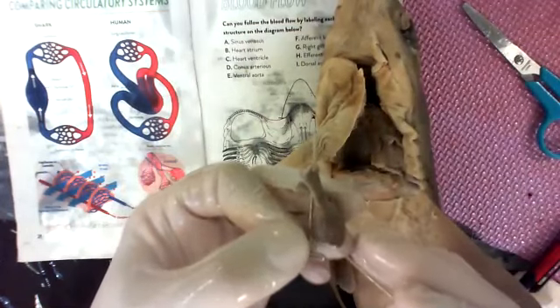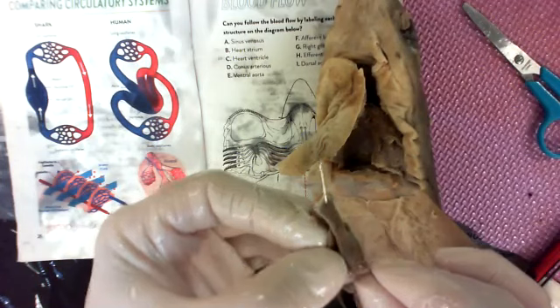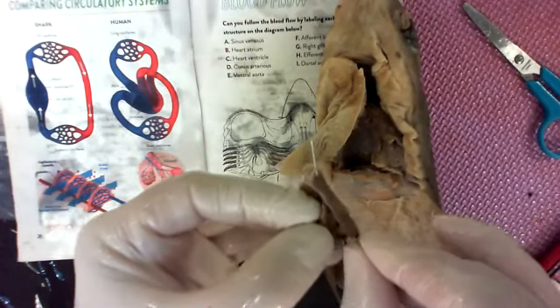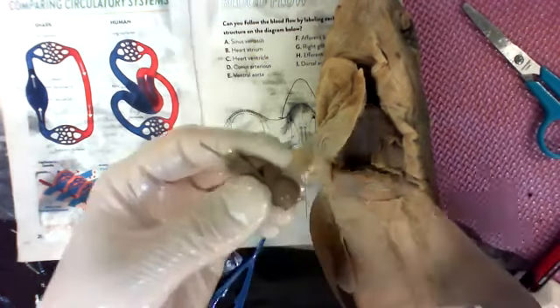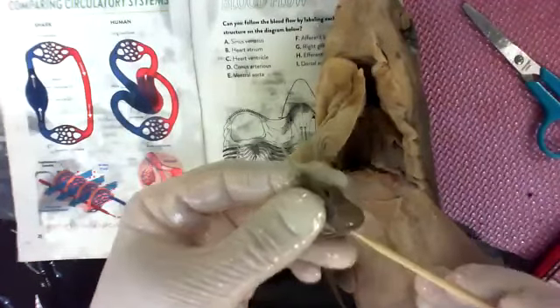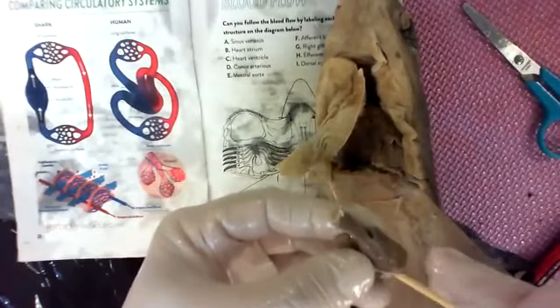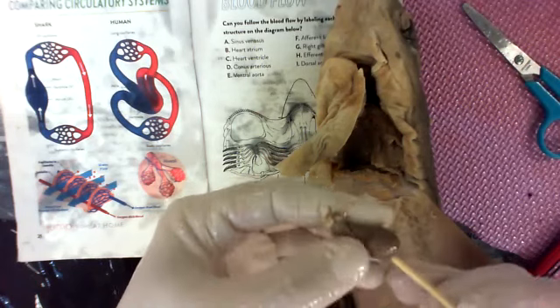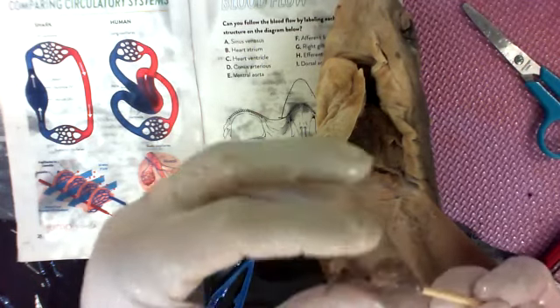I can see, if I open this back up, I'm getting dangerous here playing with pens this close to my finger. See that hole right there? That's where the atria is at. So if I follow this backwards, I'm not gonna put a pen in it, put the pen back in, stick it back in the pad. I'm gonna put this in there. It's a little bit bigger, but I think it'll fit. There's the hole again, sliding it in. Boom. Now I can feel it.